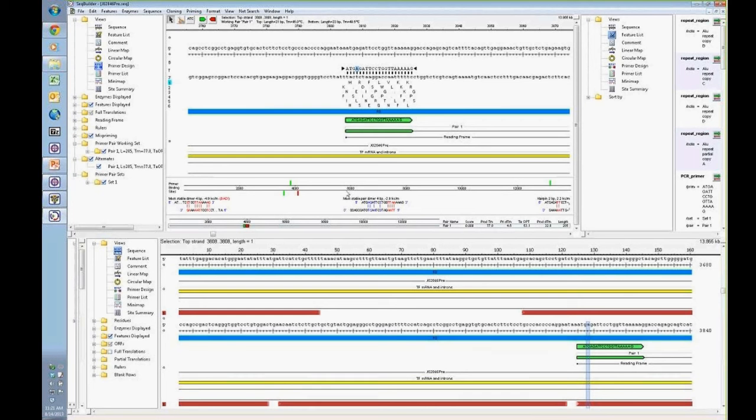What this is showing you here is the possibility for that primer to bind with the top strand primer, and the bottom strand primer. So right now it's giving you an okay, but if it would not recommend this combination, this also would say bad. And then here would be the hairpin at the 3' end.